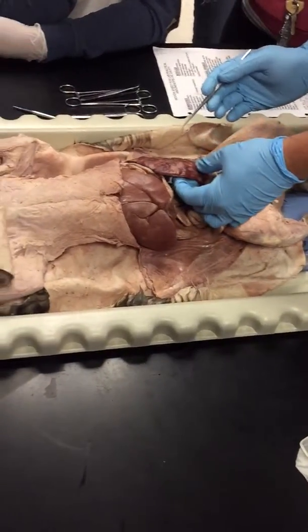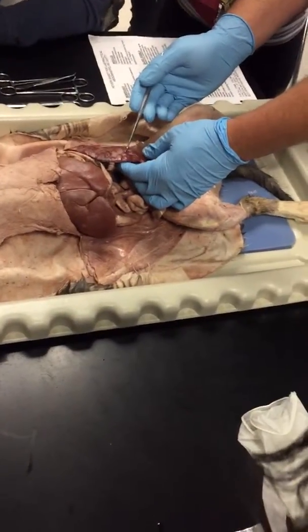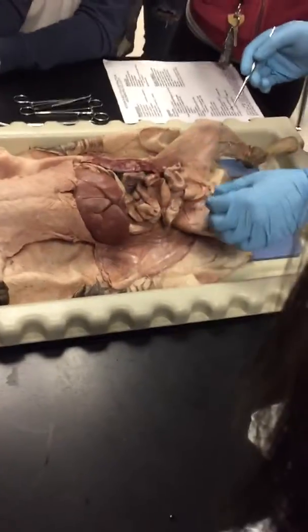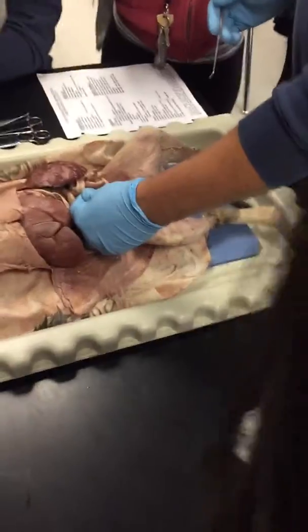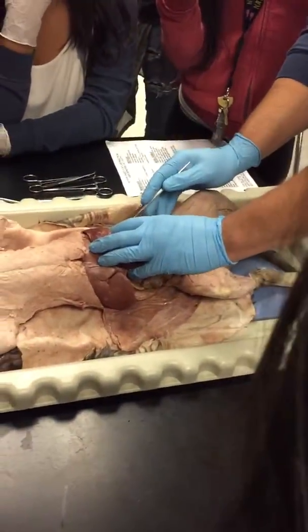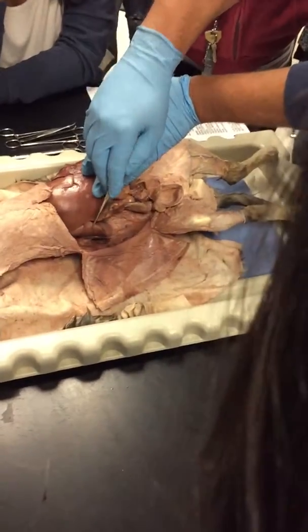This is a gigantic spleen. Now, on the test, I will probably use a cat that has a spleen like this. It'll be very, very obvious. And then right here, what's this? Urinary bladder. Okay, and then these guys right here, kidneys. Okay, one on each side.